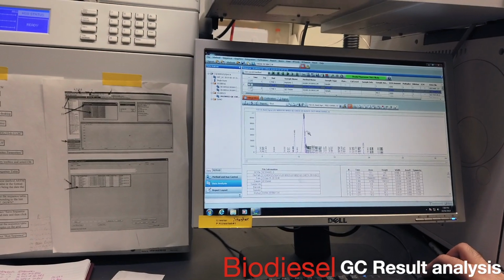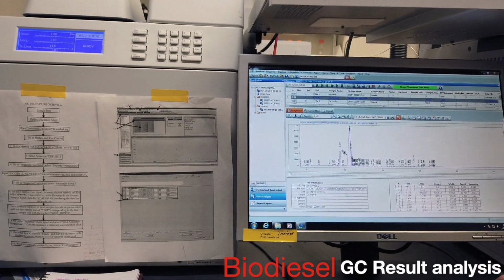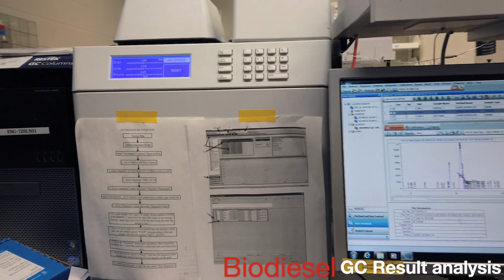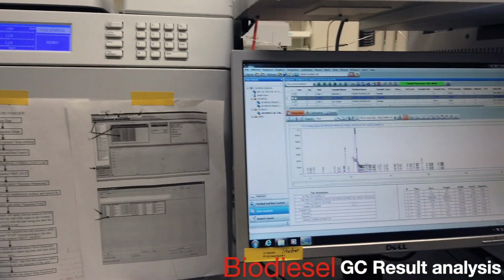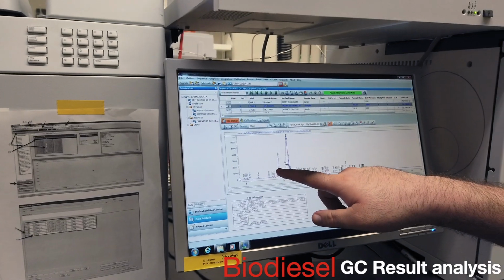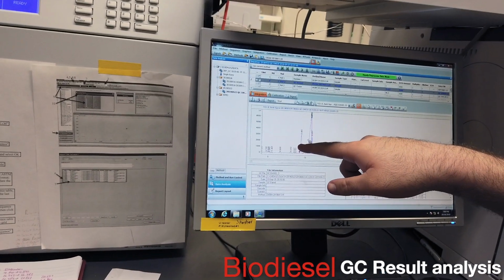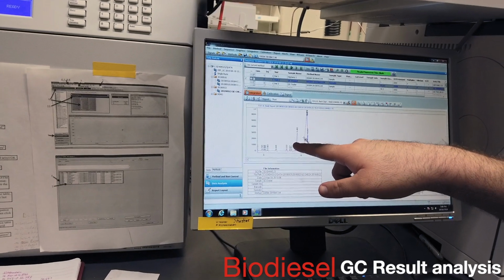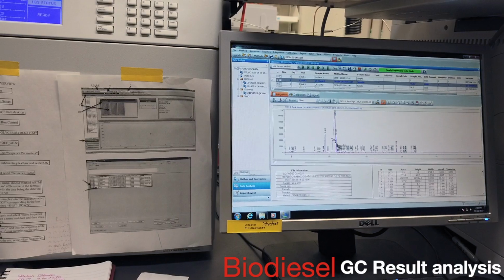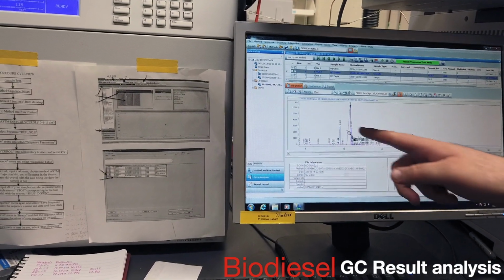It's funny that he sent Mason City biodiesel. Why? Because it's special. They use a higher amount of corn oil, so you normally wouldn't see this peak. This is actually ethyl ester. Most other biodiesel does not have ethyl ester in it, but because they have such a high amount of corn oil, it produces large ethyl ester peaks.